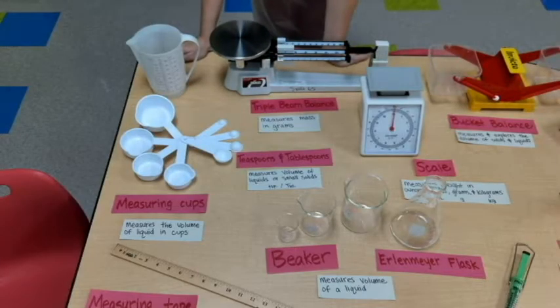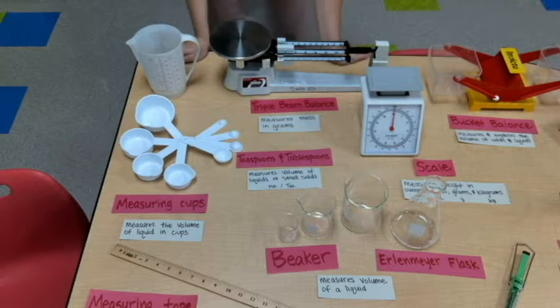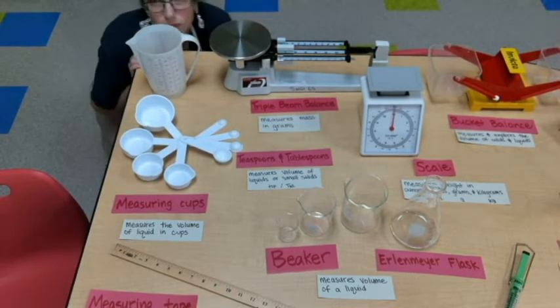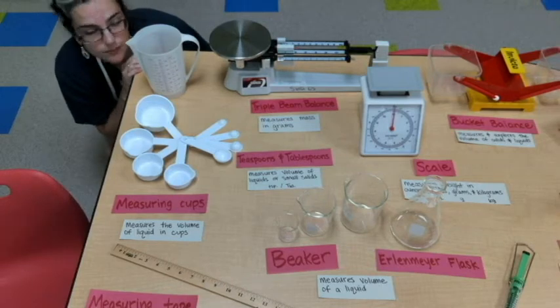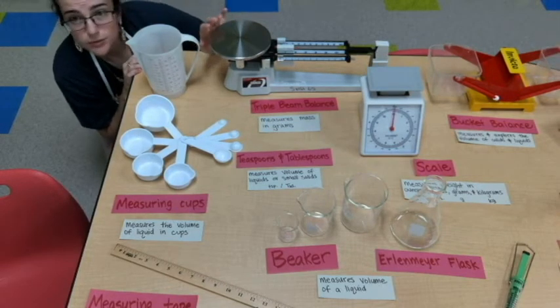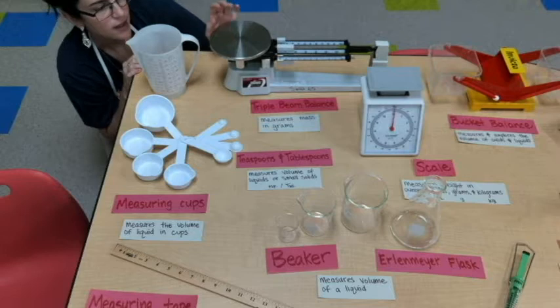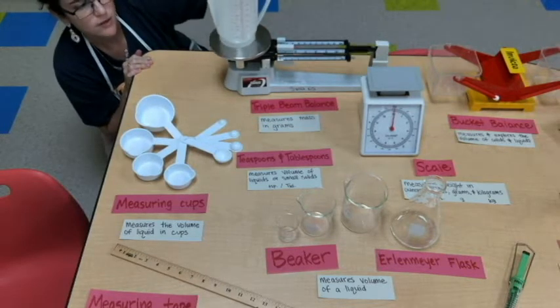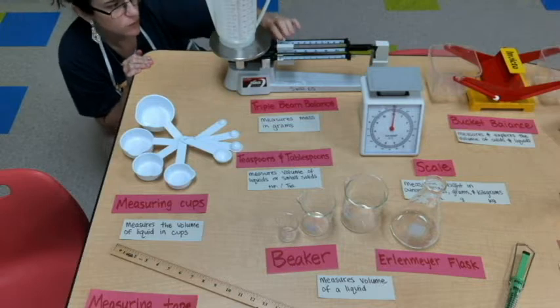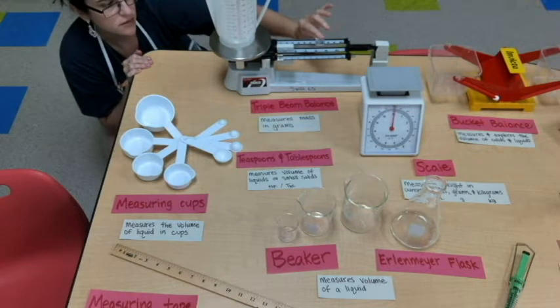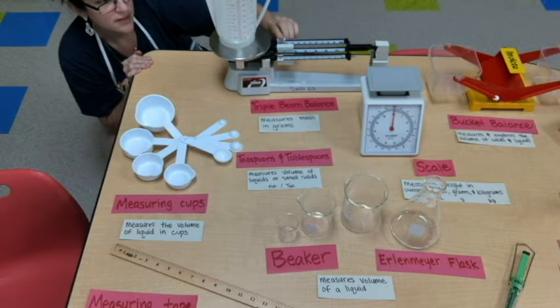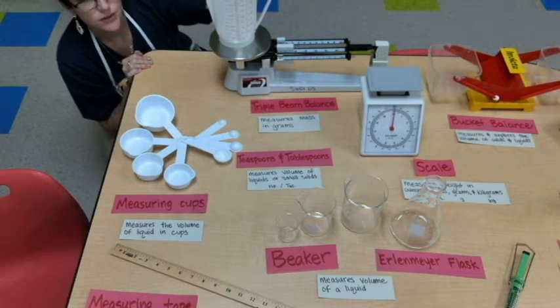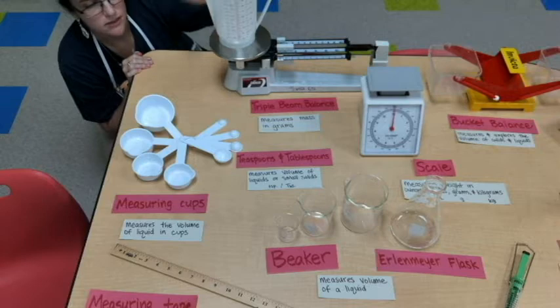So this is our triple beam balance right here, and we would place an item, such as so, on top of the scale, and we would move these knobs over to help us get an accurate measurement for trying to determine the mass of this object.